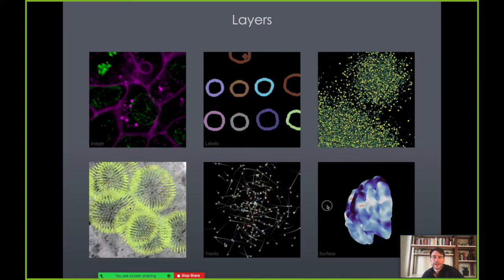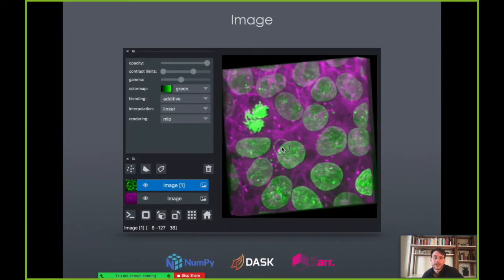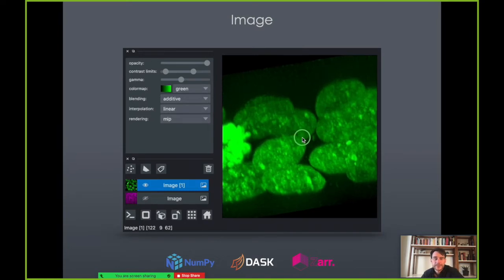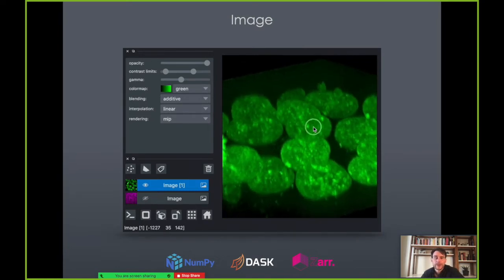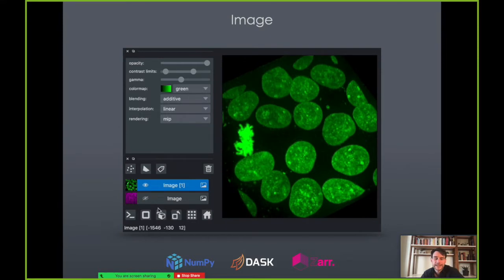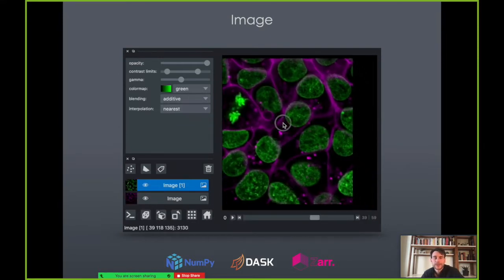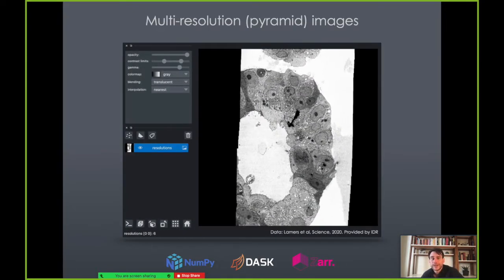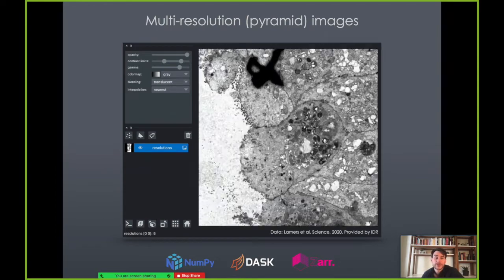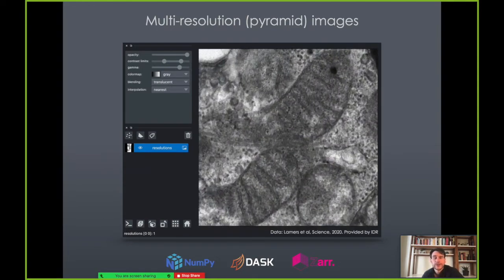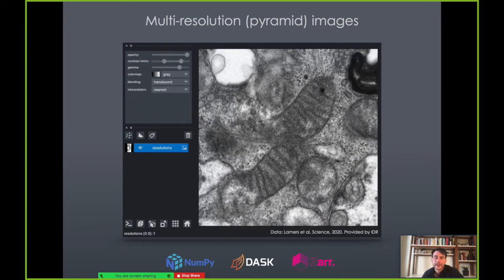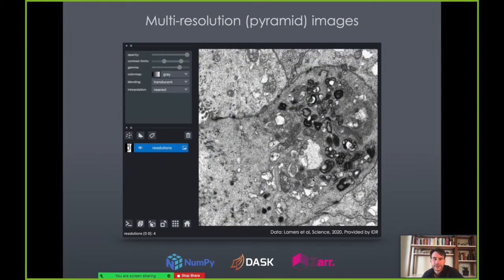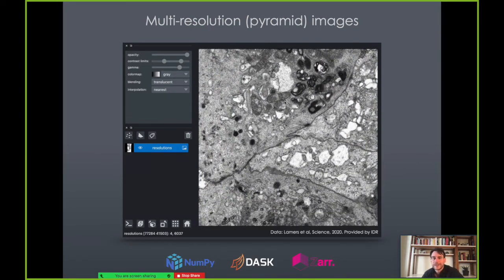The image layer is probably our most fundamental. You can have 2D rendering, 3D rendering, adjust contrast limits, and color maps. We work really well with array-like data from NumPy, Dask, or data backed by Zarr. We can also support multi-resolution pyramid image data. This is an electron micrograph that's hundreds of thousands by hundreds of thousands of pixels, and in a lazy loading fashion, kind of Google Maps style, we load in just the amount of information you want to see on screen, retaining interactivity even in really large datasets.